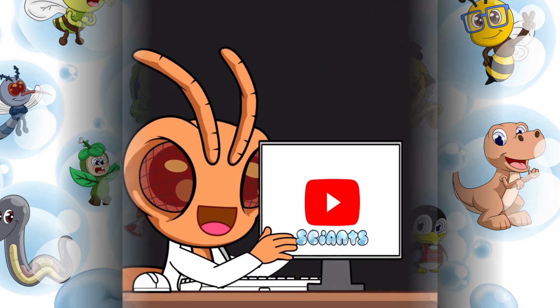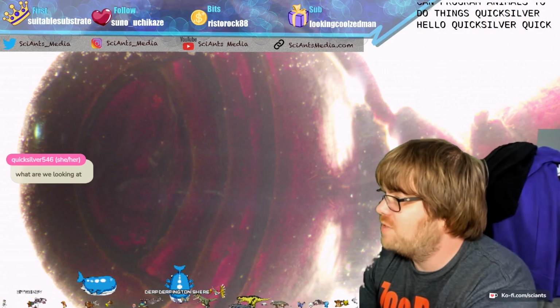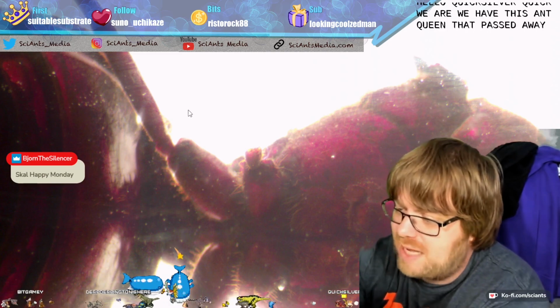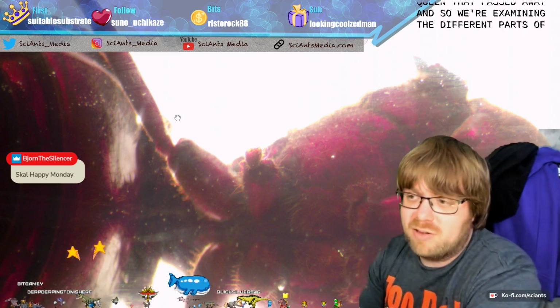SciAnts. We get experimental science. We're curious, non-judgmental. We have this ant queen that passed away, and so we're examining the different parts of her body to analyze and see what it looks like.